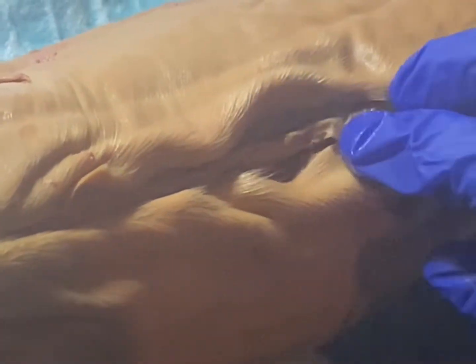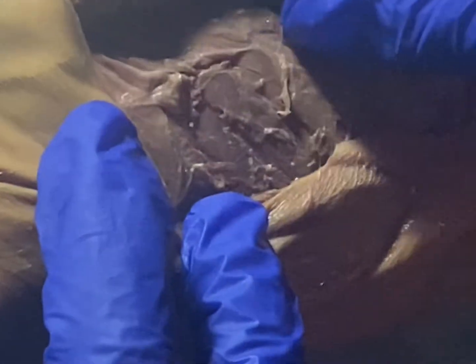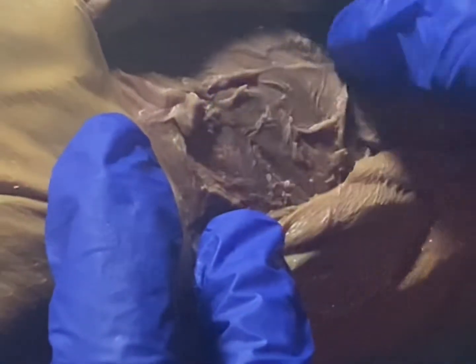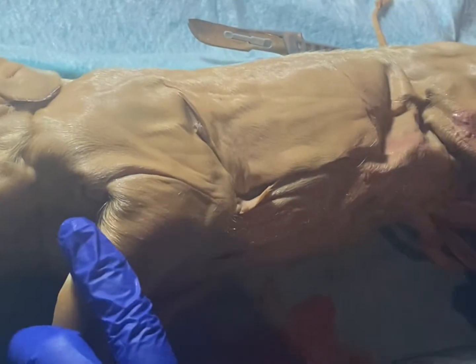It's these bones encompassing the spine. We have the thoracic cage, which I only opened up one side of the pig, so there's the costal cartilage, which is covering it, but we can kind of see his ribs covered by that costal cartilage, as well as some fat and adipose tissue and muscle.